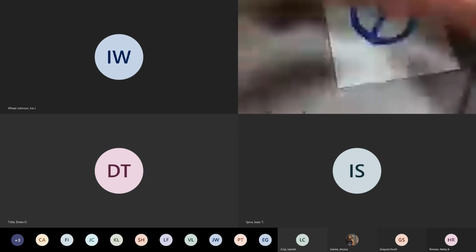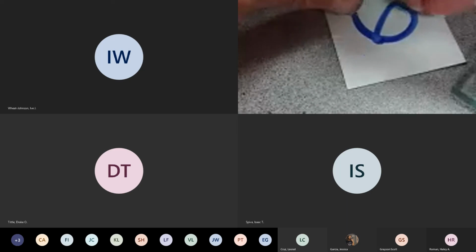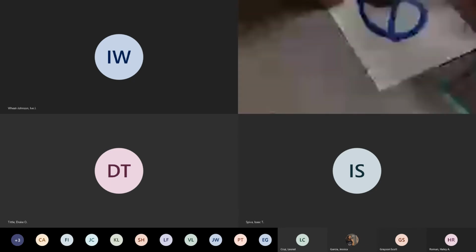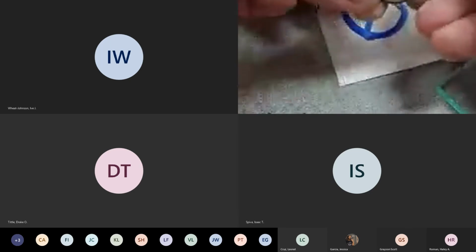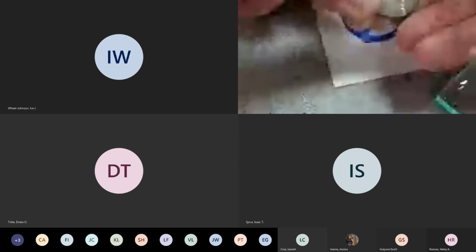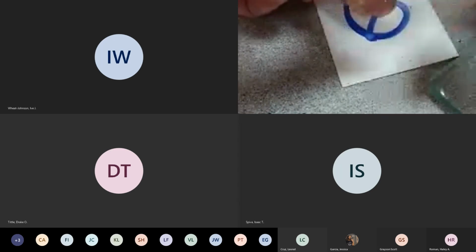Hardness. Not cutting a rut in it. Let's check the penny. Looks like a new shiny rut in that penny. That's not powder. That is a shiny rut in there.